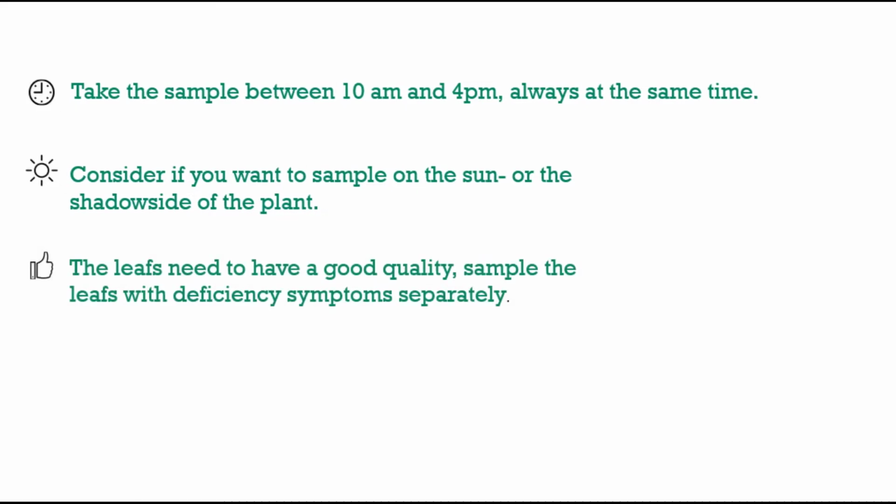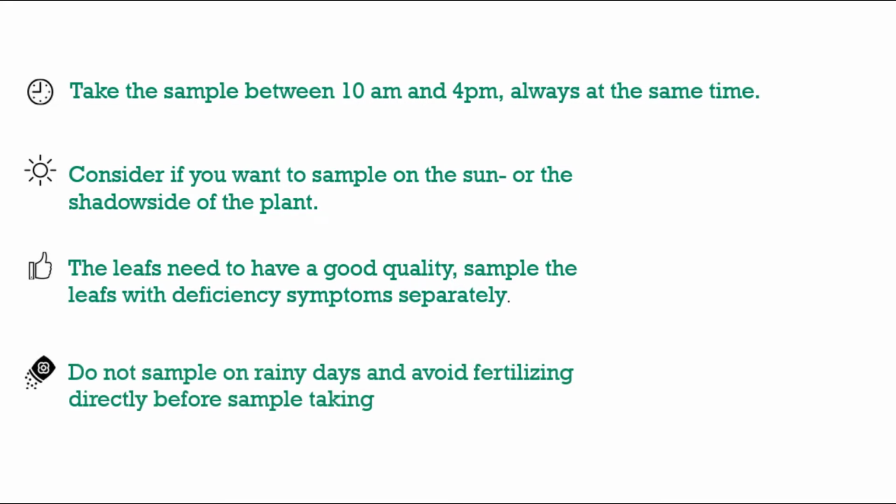The leaves need to have a good quality. Sample the leaves with deficiency symptoms separately. Do not sample on rainy days and avoid fertilizing directly before sample taking.